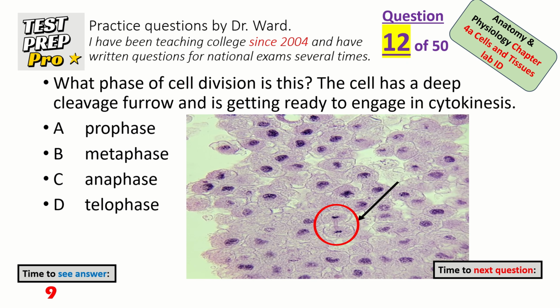What phase of cell division is this? The cell has a deep cleavage furrow and is getting ready to engage in cytokinesis. Telophase.